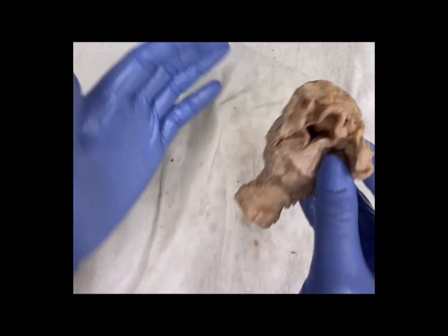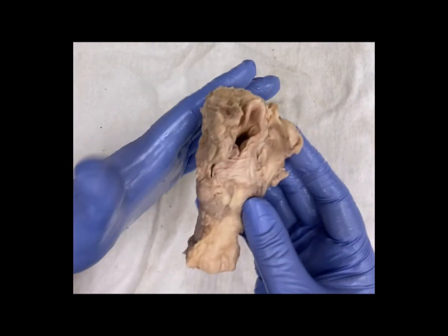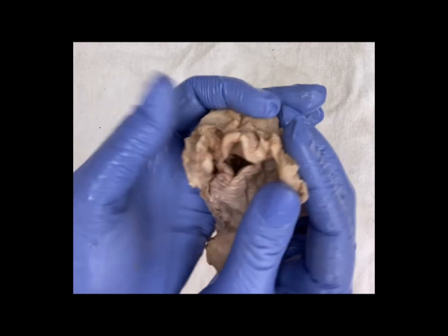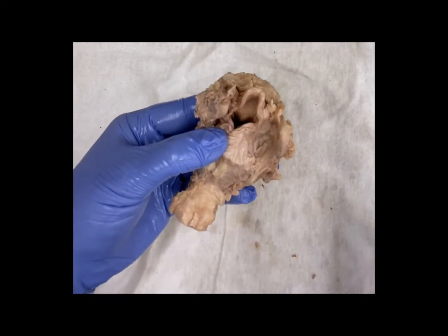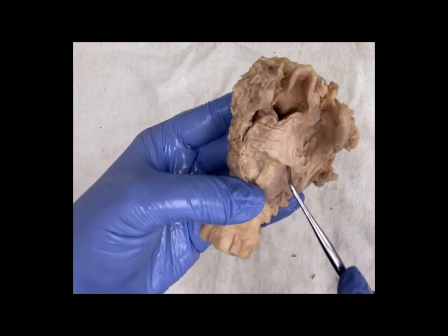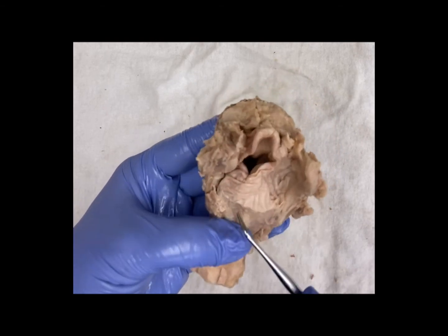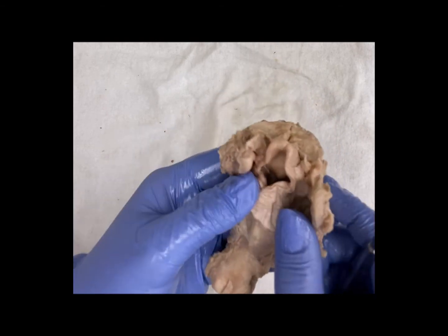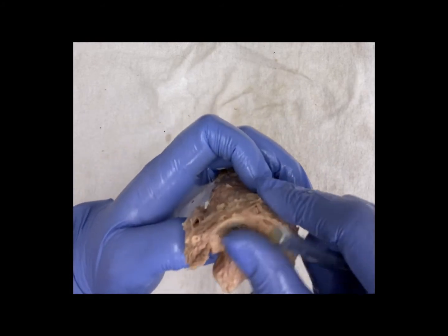So this is more or less what an actual laryngectomy specimen would look like, less anatomy, more just what you would get as a larynx specimen. So here at the top, you can see the epiglottis, you can see the aryepiglottic folds, you can see the arytenoid cartilages, and then this would be an example of what a mucosal margin would look like. Now, obviously this is very fixed, so it would be more reddish in a fresh specimen. But here, I really just wanted to point out the mucosal margin.